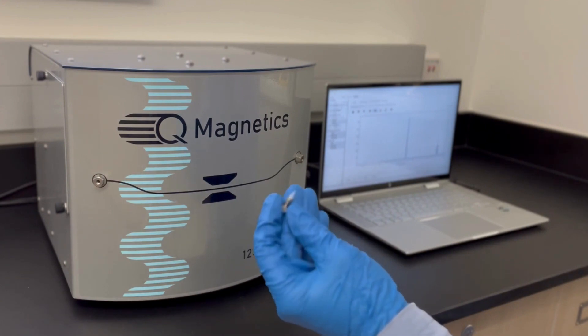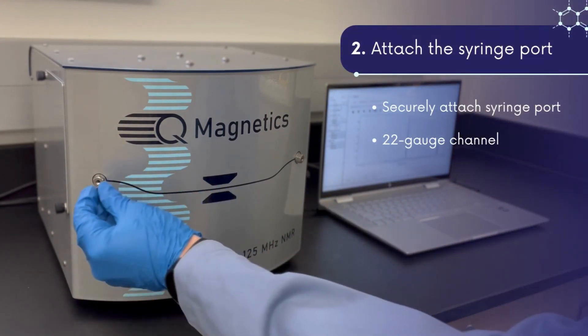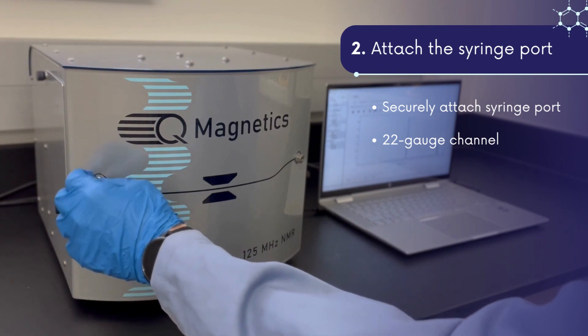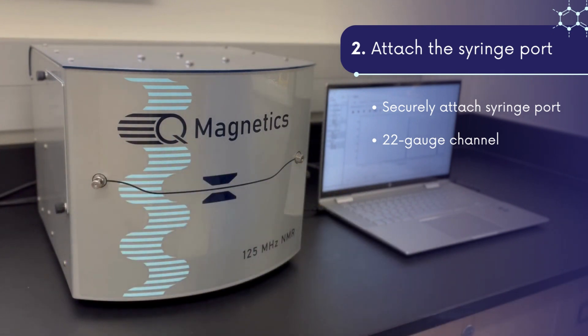Start by securing the stainless steel syringe port to either of the two front panel fittings. The syringe port is necessary to guide a 22 gauge needle when sample is ready to be loaded.